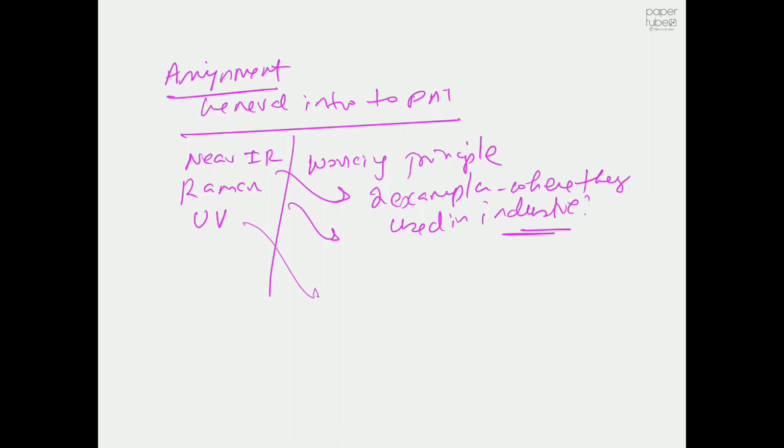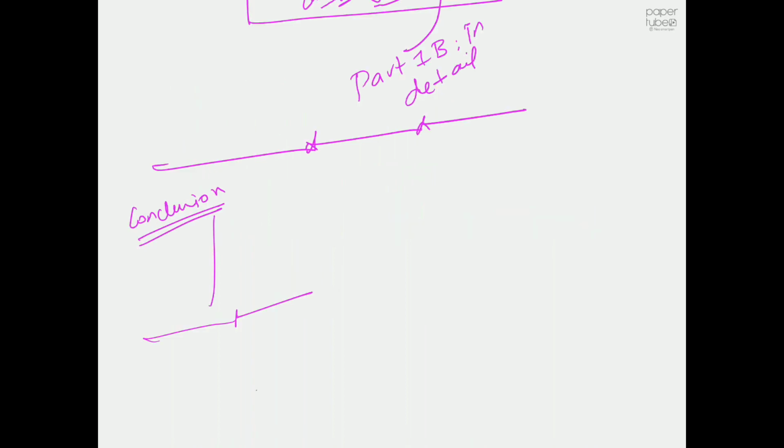Try to find some literature where they used PAT: UV, Raman, near IR. And then try to include this in your final report.